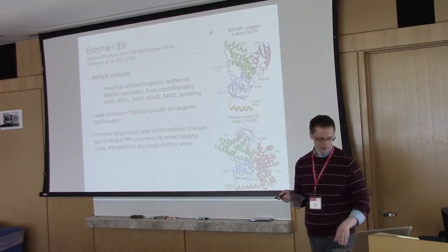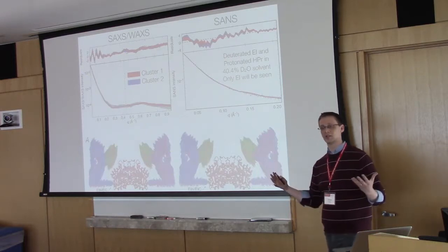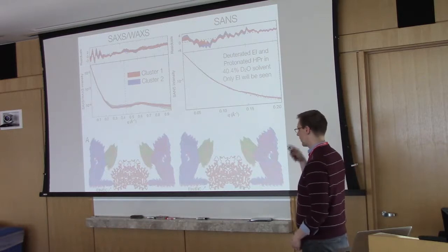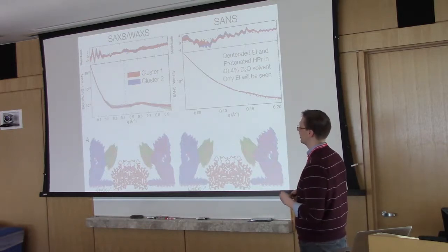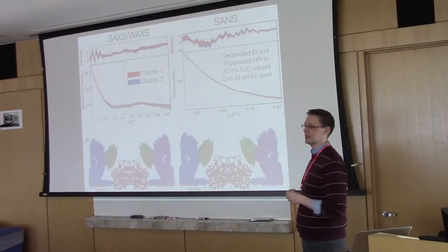I'm not showing the full complex here, but here you go. It's the full complex. It's a large 150 kilodalton complex. You can't do that with NMR typically. However, they were able to piece out a lot of this information by combining SAXS and WAXS data with these.